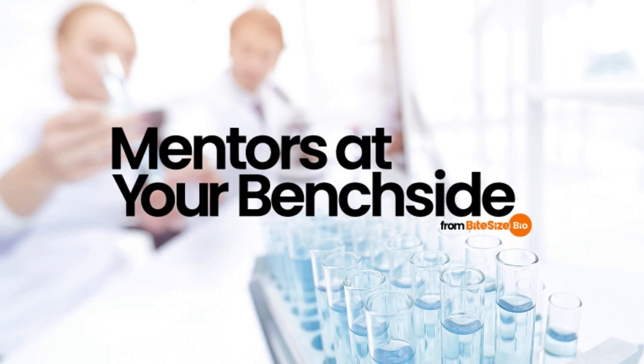Even if all instruments in your lab are calibrated, odds are that they need regular care to operate at their maximum accuracy and precision. For instance, pH meters need routine maintenance that can be performed by novice scientists, while more sensitive instrumentation may require shipment of parts to vendors or even on-site visits. Again, check your user manuals and call equipment manufacturers to ensure you take appropriate measures to keep lab equipment running under conditions optimal for accuracy.